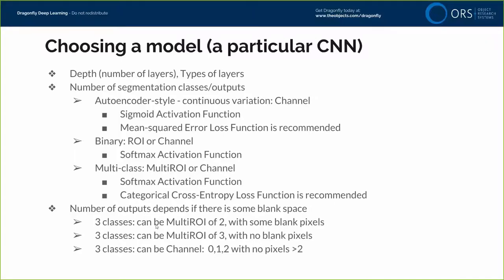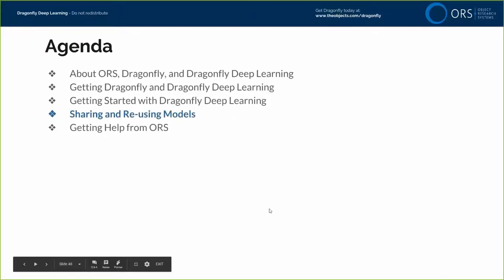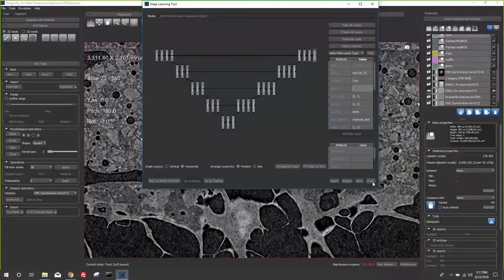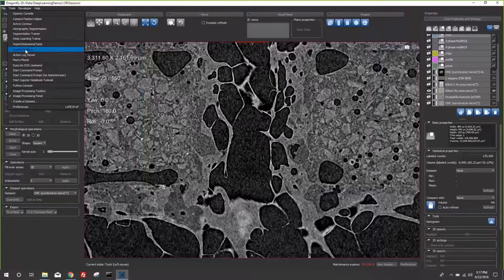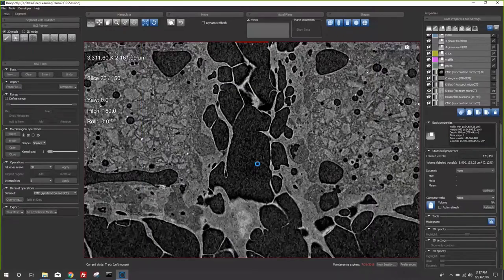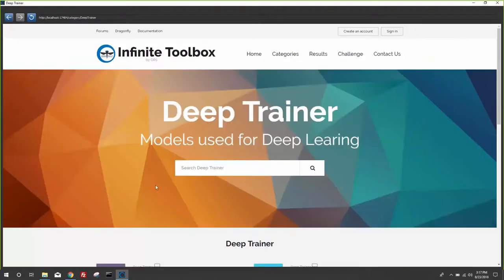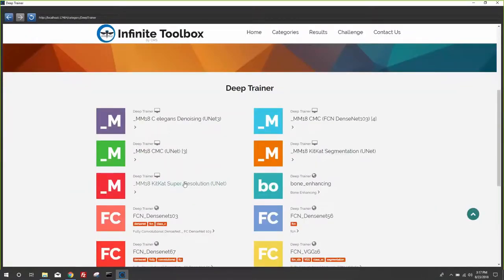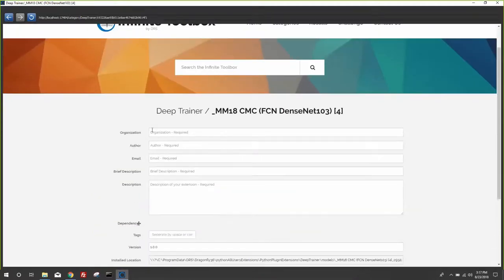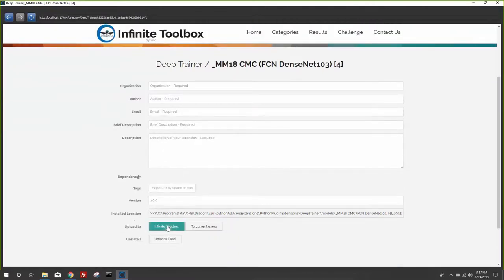Sharing and reusing models is quite easy. In the Infinite Toolbox, scroll to find the model you want to share — for example, the filter used for the ceramic matrix composite that's only on my computer. Type in your contact information and a brief description, then click Upload to Infinite Toolbox. Anyone else connected to Dragonfly can then go into their Infinite Toolbox account, download the model, and use it.